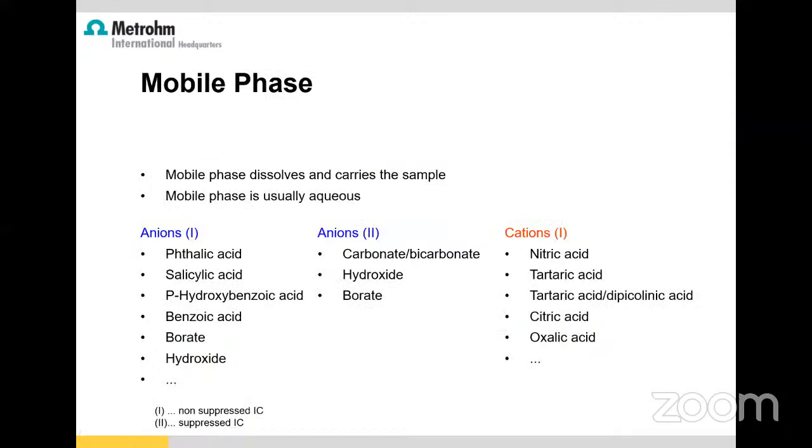Next, we go to the mobile phase. As I said, we will be using water-based mobile phases, so aqueous mobile phases. We need very good quality water. We predominantly use carbonate bicarbonate mobile phases. We also use hydroxide mobile phases.